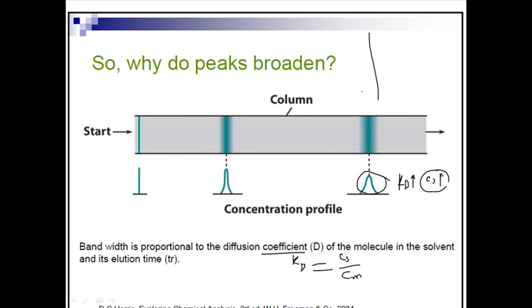That's why if we draw a curve like this, with detector and time here, we can find the first bands are really close, like having a really thin peak like that, but the end peaks are slightly broadening like that, because as time goes by, some of these analyte molecules need to elute really last, at later times.